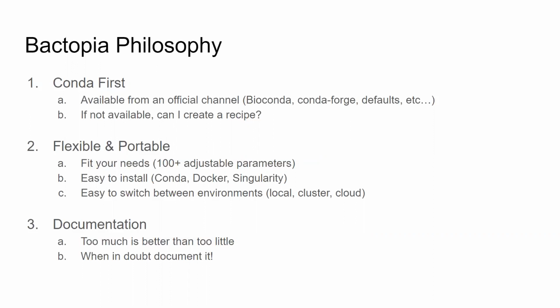And documentation. Too much is better than too little. And when in doubt, document it. I think I've done a pretty thorough job of documenting Bactopia. If you see something missing, please let me know and I will put it on there.